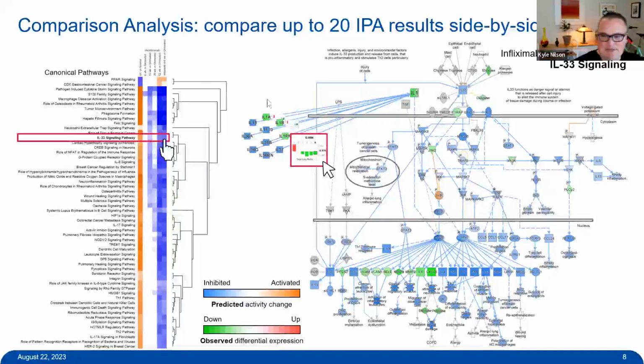at the same time. So for example, in this impossible to read text, I have ulcerative colitis versus normal as my initial condition. And then I have a time course of vedolizumab treatment, as well as a single condition of infliximab. So this way, we can compare and contrast how vedolizumab works over time with how infliximab works after 4 to 6 weeks. And we can also confirm that those are the opposite of a disease versus normal profile.